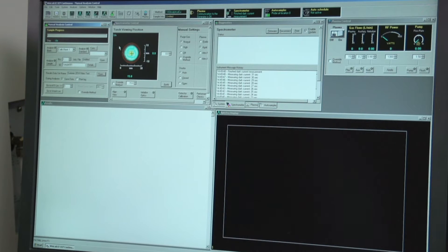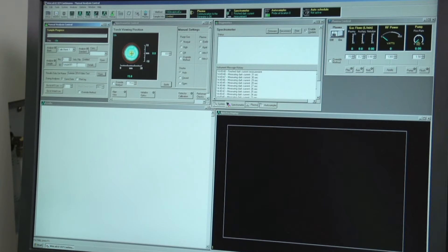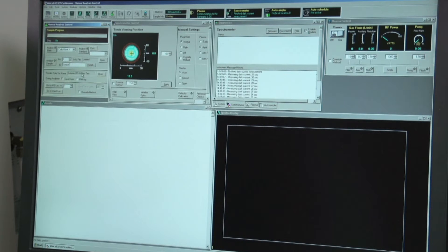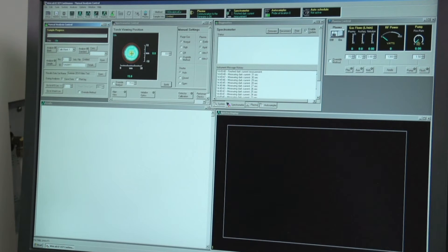Once you have analyzed the blank sample, move on to the first sample. You always want to start with a low concentration when working with a series of solutions. In the sample ID window, type in A1. Make sure your partner places the line into the volumetric flask containing the solution, and when ready hit analyze sample.